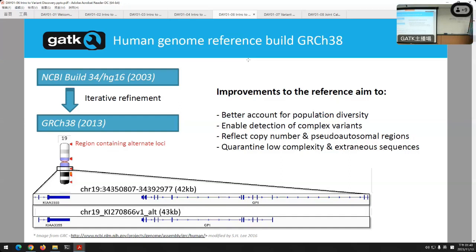Okay, so you can look at that now, and actually, I have a workspace I was mentioning where I've added that into my own reference, so you can play with that too if you want. But for most of the work we'll do today, I think it'll be against what we call HG38. That's the most commonly used reference today.